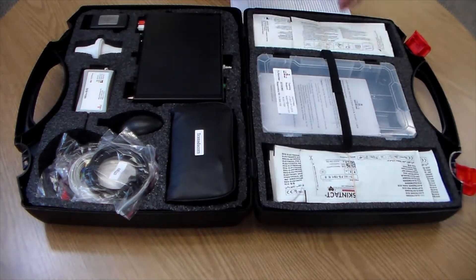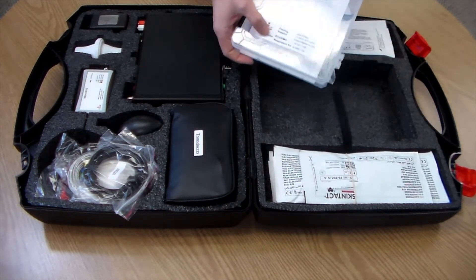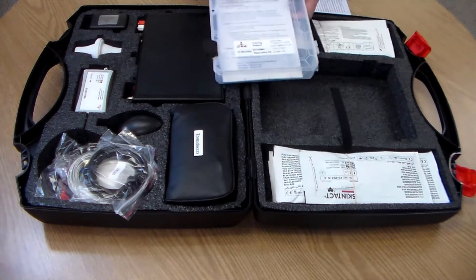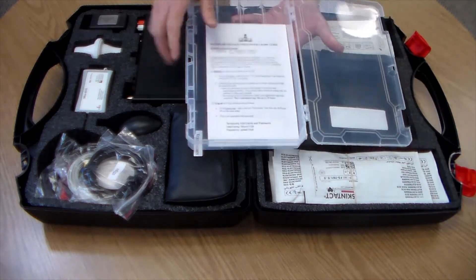This plastic case has our tech support information. Inside is a software installation guide with your temporary username and password. Remember to register your own username and password at iWorks.com.